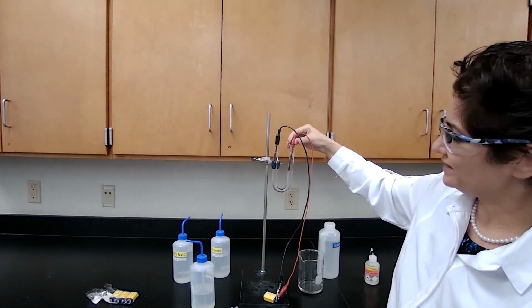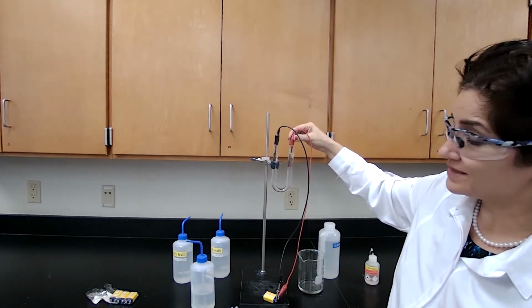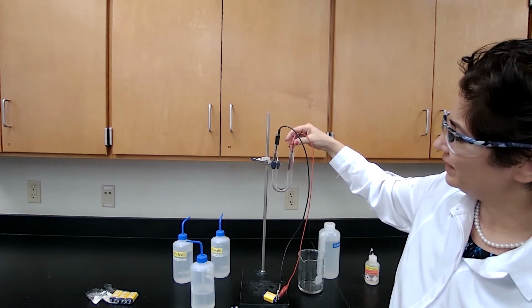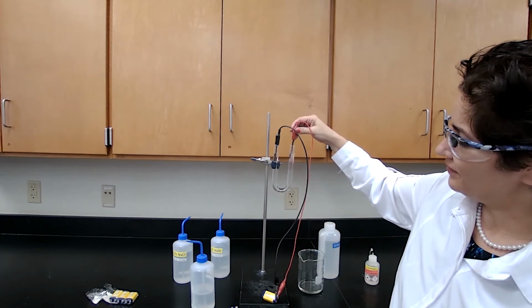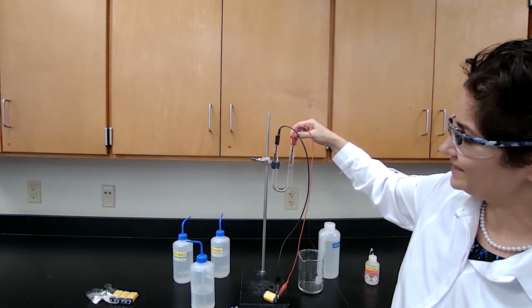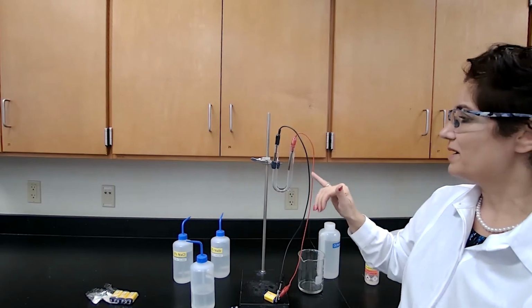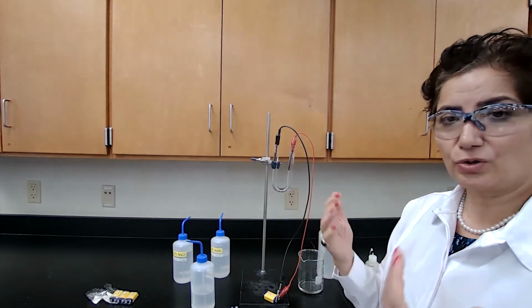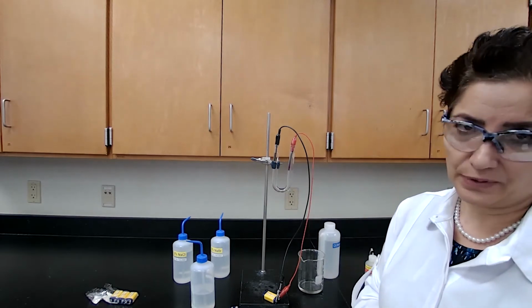And if you notice, you can see from the video that the pink color is appearing right now, and this is the pink color of phenolphthalein, which in basic solution turns pink. I will give more time because I want a deeper pink color for you to be able to see it, but for me it's very obvious.